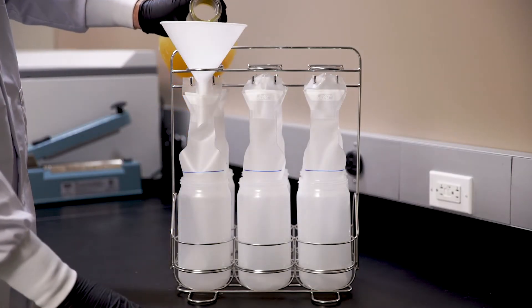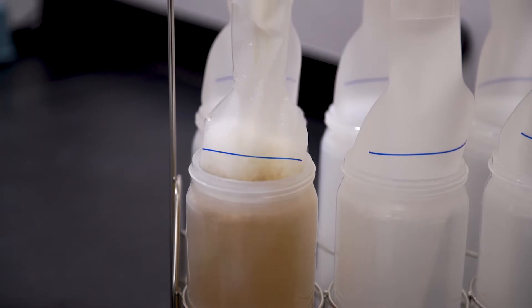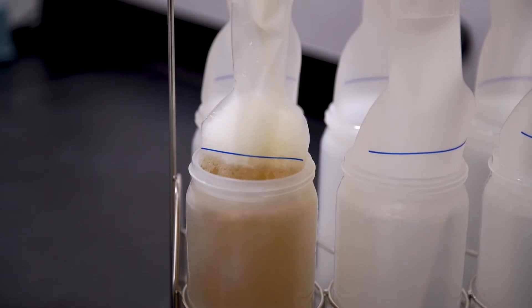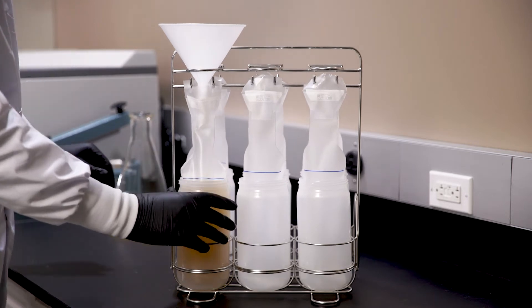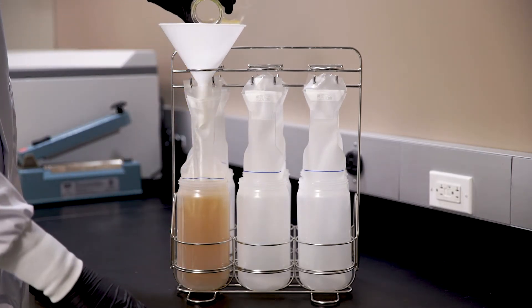With the end of the funnel past the valve, pour your sample into the funnel until the liquid reaches the blue maximum fill line on the liner. Next, lift and tap the bottle so the liner expands into the bottom of the bottle. Pour an additional sample to again reach the blue fill line.